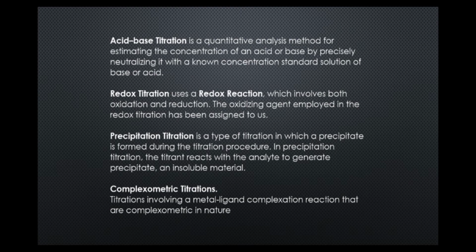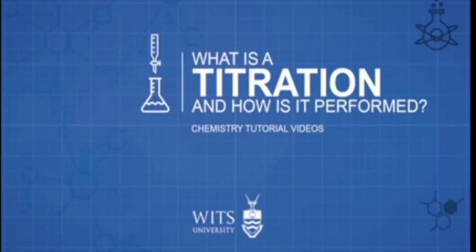So the last one is complexometric titration. This titration involves metal-ligand complexation reactions that are complexometric in nature.